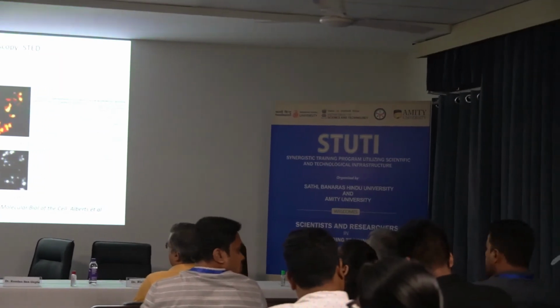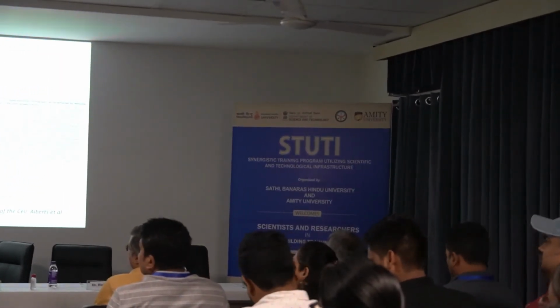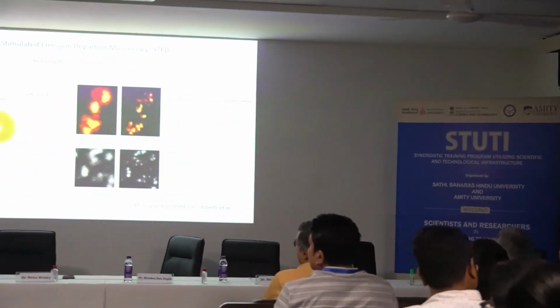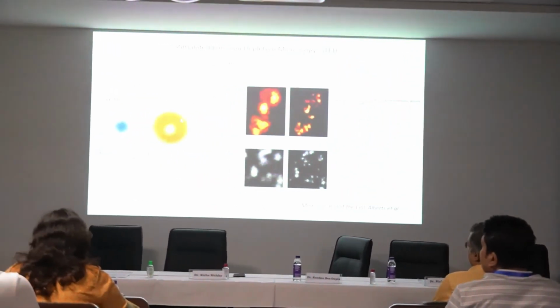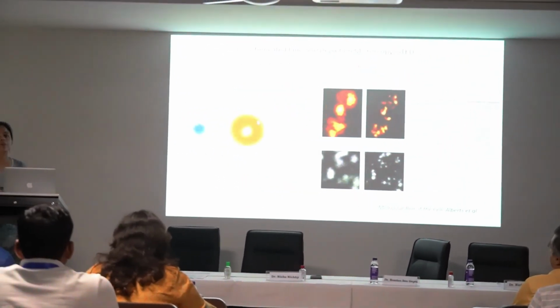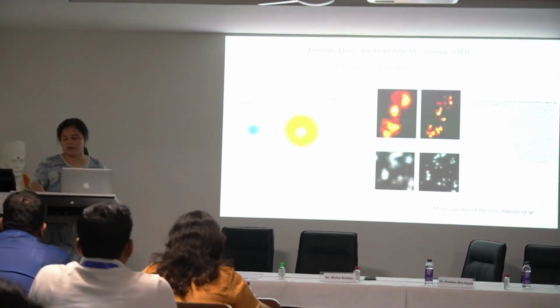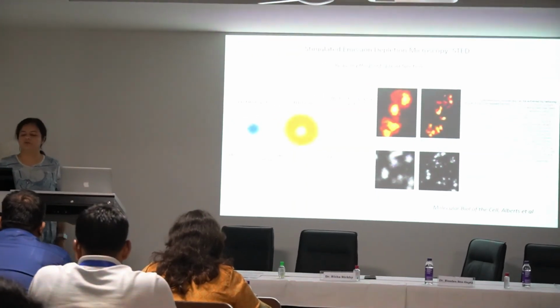Also, one more thing which I have not done here is I think we should look at the Jablonski diagram to actually understand this better. Okay, so that is also something I can share with you. I can share this entire set of things with you if you want to refer to it, but really it's given very well in some of the other lectures given by Stefan Hell himself. So you should look at those lectures.